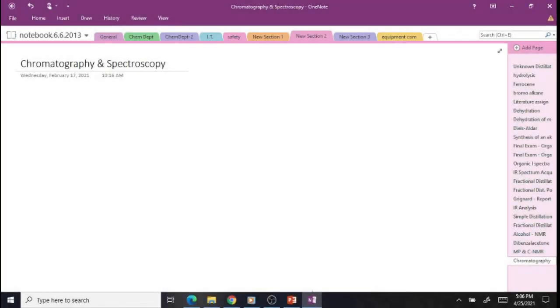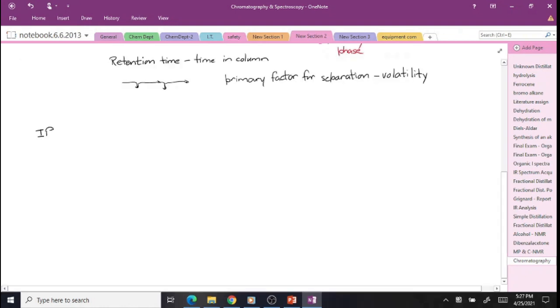Now we will move on to chromatography and spectroscopy, IR or infrared spectroscopy. The peaks in infrared spectroscopy give us information about the types of bonds. So peaks specifically correlate to specific bond types. For example, if we have a strong absorption between, say, about 3300 to 3600 inverse centimeters, we also refer to those units, the inverse centimeters or 1/centimeter, as a wave number.